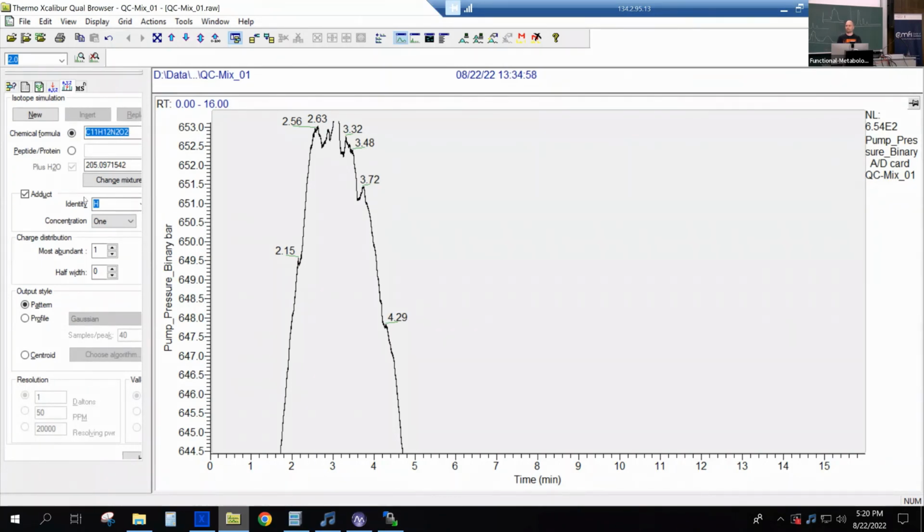For that reason, do you run any pre-screen studies before you run a full study? If there's contamination, yeah. If people contact you before they have all the samples, then yes. But sometimes it's just, oh, Daniel, I have like 200 samples, can we analyze them? But then it's good if they either bring their own column or if there's a pre-column. Ideally one is involved in the planning, and ideally it's not only me, but also a statistician who does some power calculation. But I think that's unfortunately not the norm. It's a more rare situation.